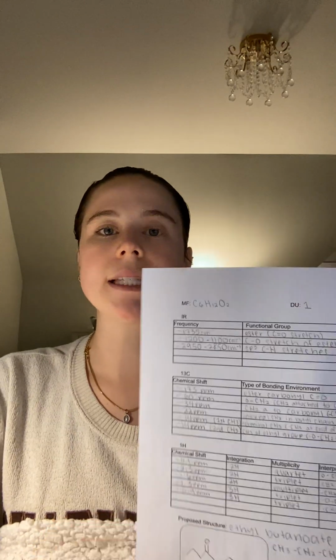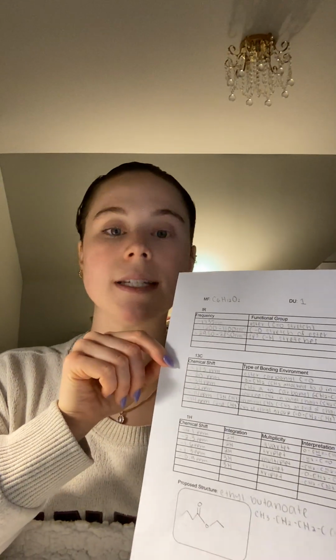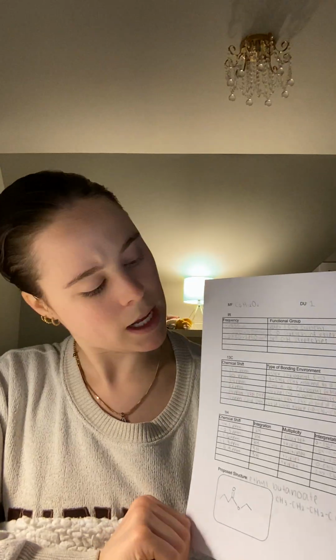So for C6H12O2, an ester with no aromatic, I would expect, so we see that the most downfield carbonyl is at about 173. And this is clearly an ester with a carbon double bonded to an oxygen. The 60 signals an oxygen single bonded to a CH2, which fits an ethyl ester.